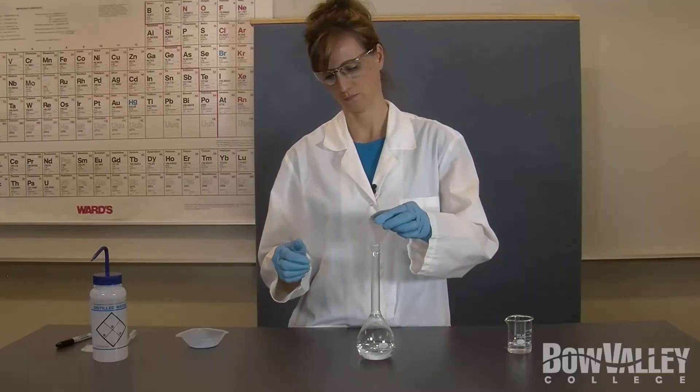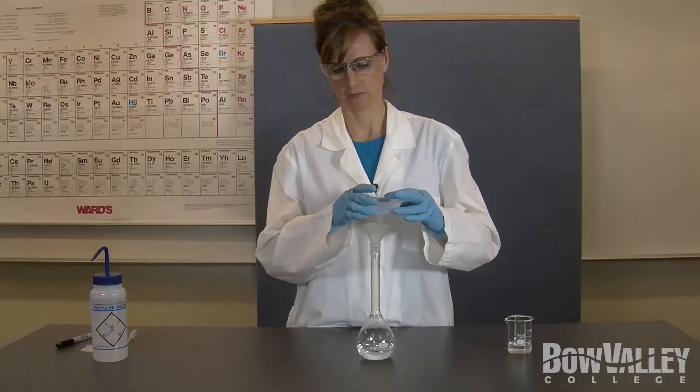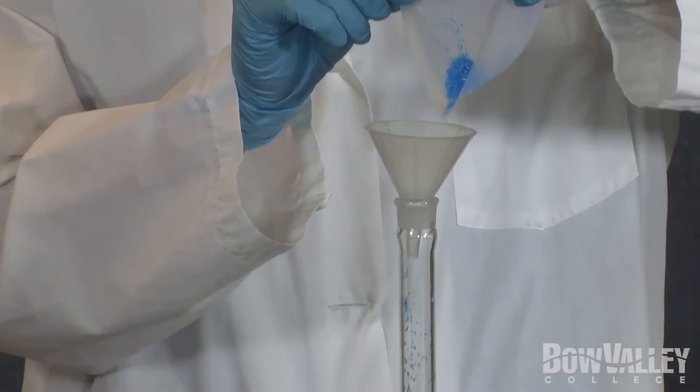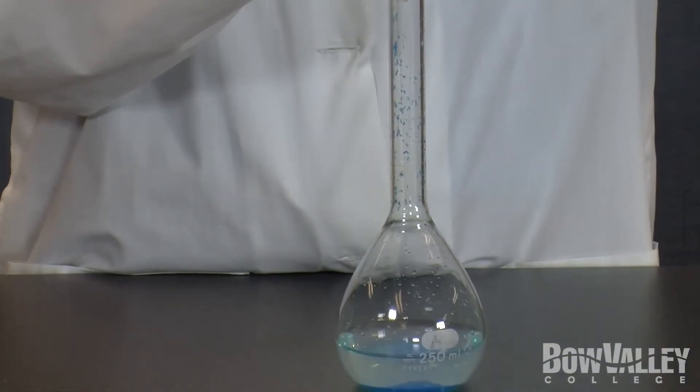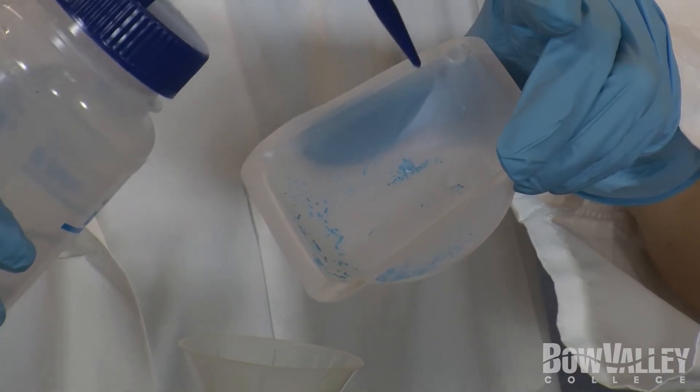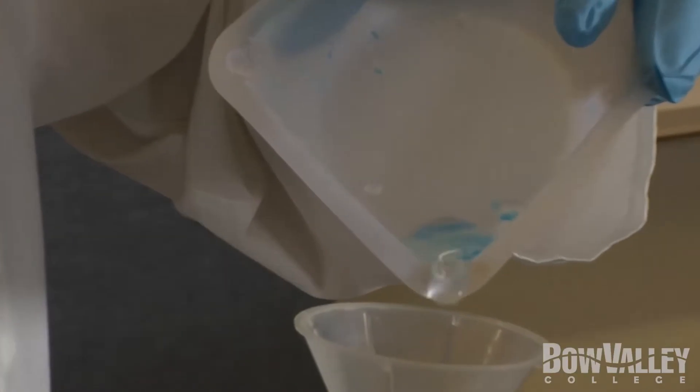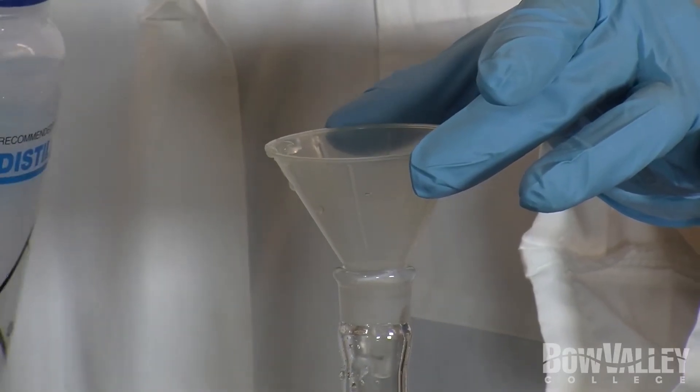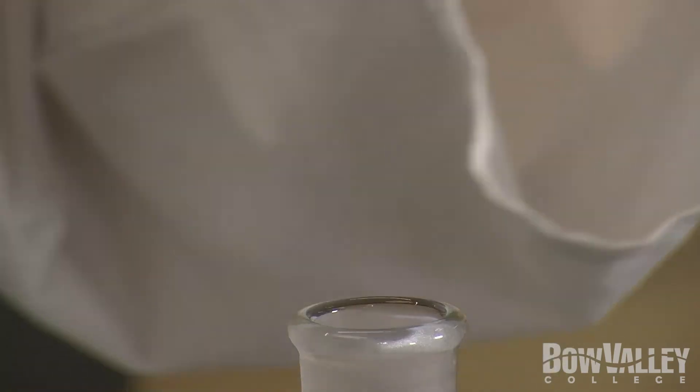Using a clean dry funnel, carefully pour the compound from the weighing boat into the volumetric flask. Rinse the weighing boat several times with a small amount of distilled water from the wash bottle. Add the rinse solution to the volumetric flask with the aid of the funnel. Finally, rinse the funnel a few times with water then remove it from the flask.